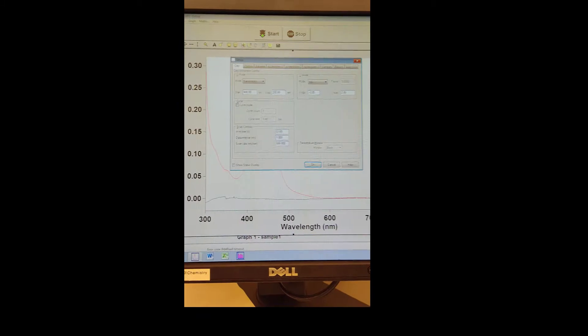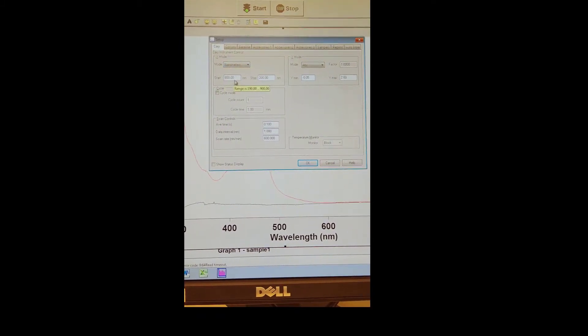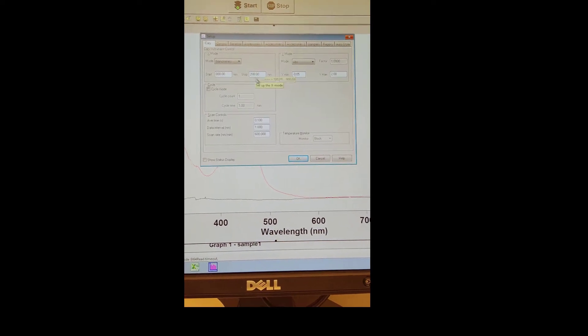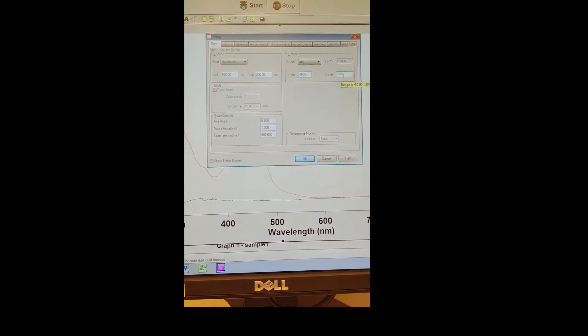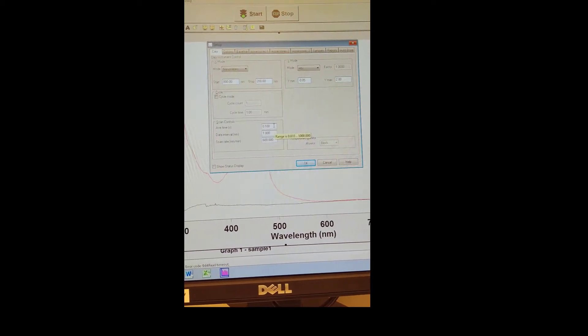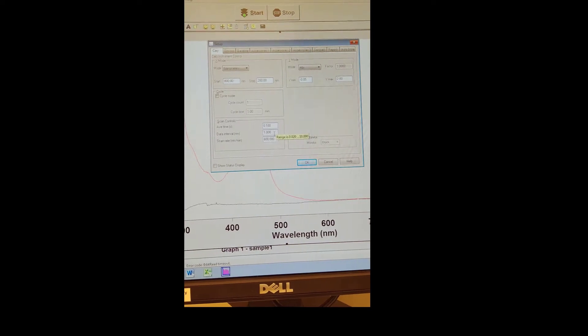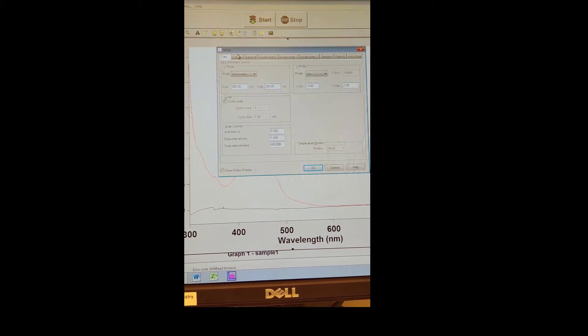Click Setup, and then under the Cary tab, make sure you're in nanometers mode. Adjust the starting and stopping wavelengths depending on what range you're interested in scanning over. Make sure you're in absorbance mode, and those are pretty typical Y-min and Y-max values right there. Same thing for scan controls. Those three values right there are pretty standard.